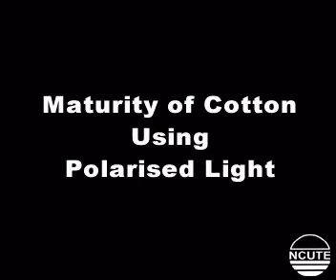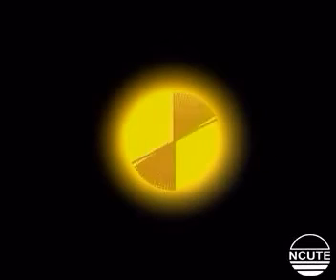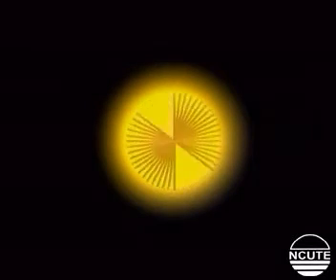Maturity of cotton using polarized light. Take a close look at this ordinary beam of light and note that it vibrates in several planes perpendicular to its direction of propagation, as indicated by the multi-directional arrows. So this beam of light appears cylindrical in shape.